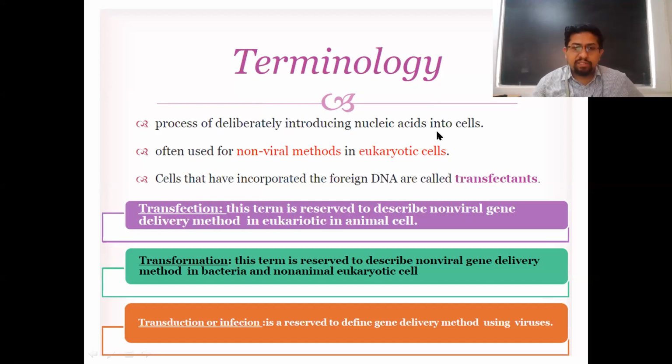Next, transduction. You know what transduction is? Transduction uses bacteriophages in order to deliver your target DNA into the bacterial cells. But it's not just that. Viral delivery: viruses can be used to deliver your gene of interest even into animal cells or plant cells. That is why we have this chapter called viral vectors, which perform delivery of your target DNA using specific viruses like adenovirus or retroviruses or virus-like particles.